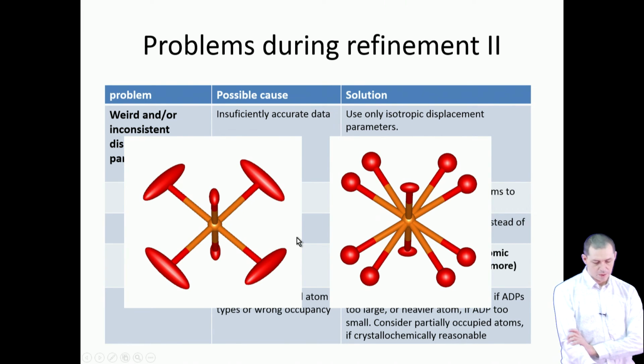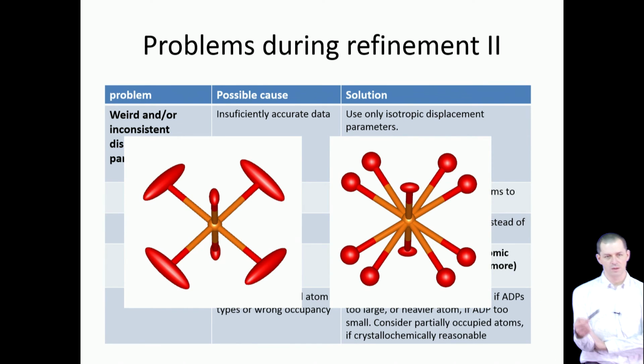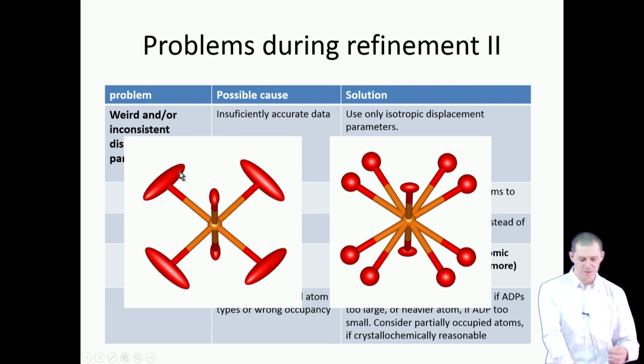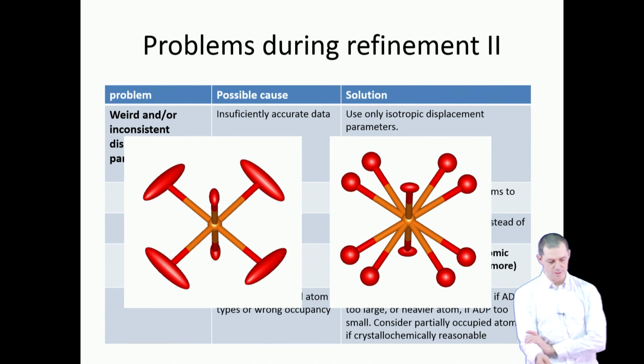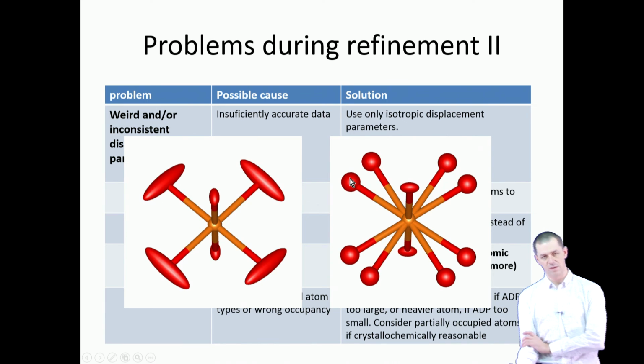This is the magnesium O6 octahedron when refined with only one oxygen position, and you see that the oxygen has a very elongated displacement parameter, and this is really a clear sign that in reality there are two positions of oxygen, one here and one here. If you place only one atom, it just desperately tries to describe the electron density of both atoms at the same time, and it refines to such a long anisotropic shape of the displacement parameter. Then you may split the atom and you obtain something like this.